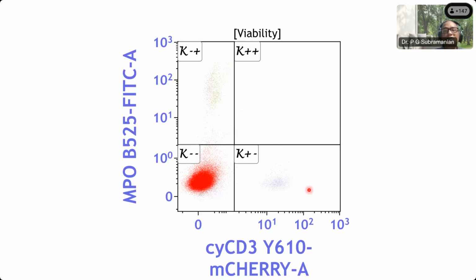This is both. This says if there is surface also it will show you positive, but if it is inside the cell also it will show you positive. So that is why it is called a cytoplasmic CD3. So this is done during processing which we do.